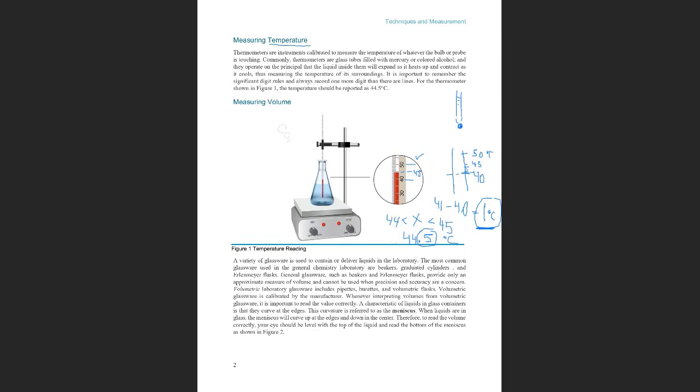Once you do it many times, you are going to be familiar with that. But what happens if I give you a thermometer where the lines are, let's say, 1 and this is 2 Celsius, and I tell you that the alcohol is here? How are you going to express the temperature? You know that the value is between 1 and 2. It's the same thing as before. You can say, okay, it's closer to the 2. You can say 1.6.